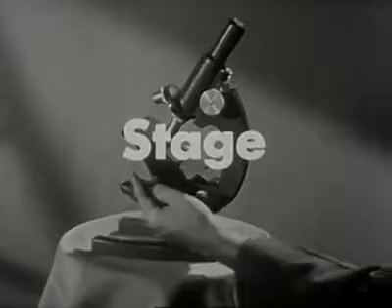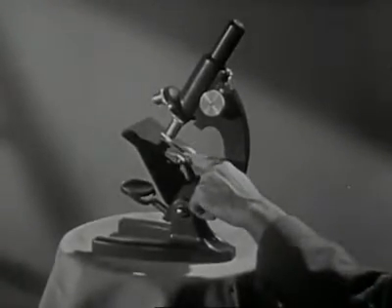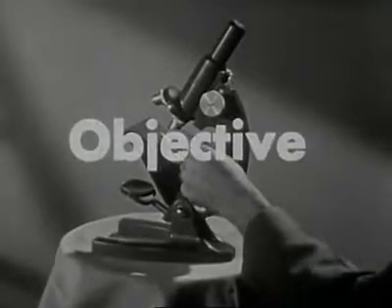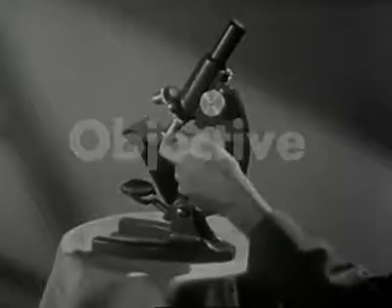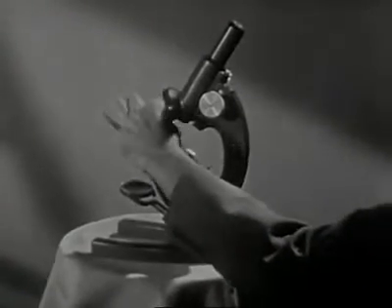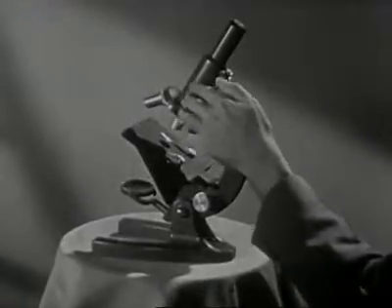The stage may be compared to the stage of a theater. It holds the specimen to be viewed, and therefore is where the action takes place. The objectives are the lenses which are nearest the specimen, or slide. The objectives are attached to the revolving nose piece, which allows the objectives to be easily changed.